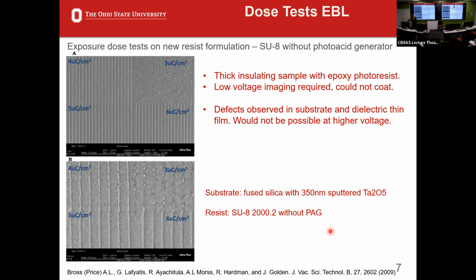The other thing you can do is actually just put a hot filament near the sample, generate thermionic electrons, and the sample itself will determine whether it attracts or repels those electrons. Oh, and you only need a couple of volts to do charge neutralization that way. Really? I did not know that. Yeah, it makes sense. You just have to get electrons to or from the sample. Yeah, that makes a whole lot of sense.